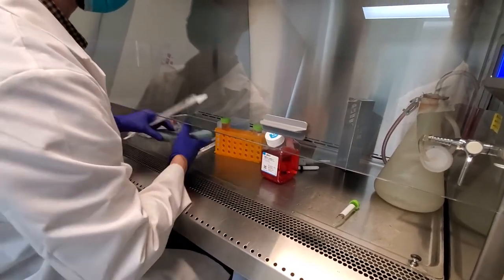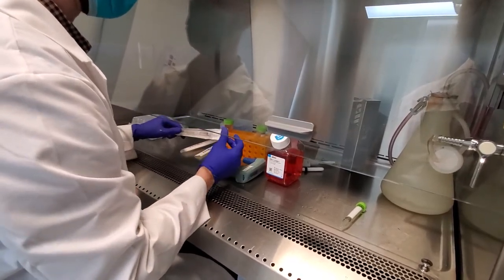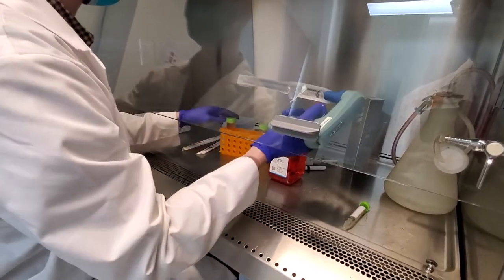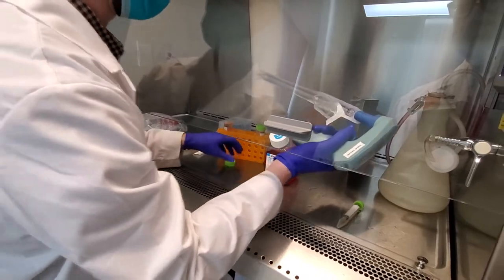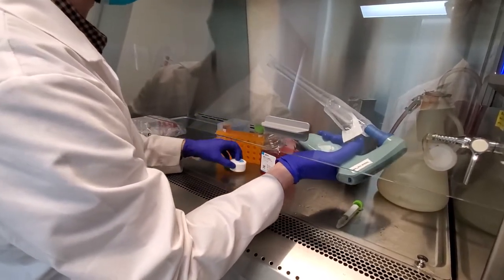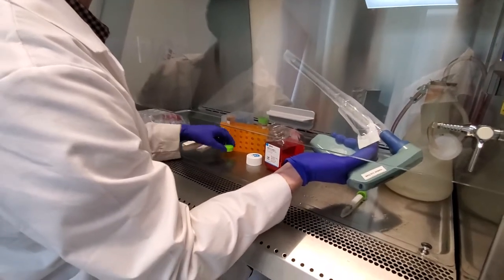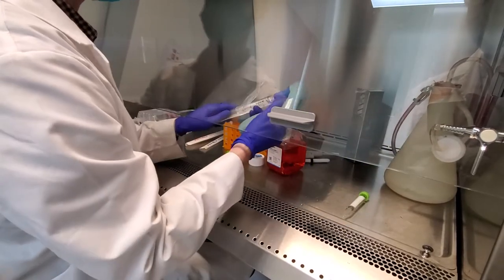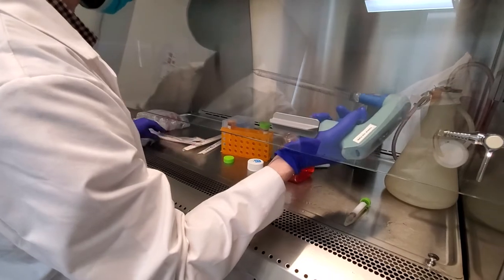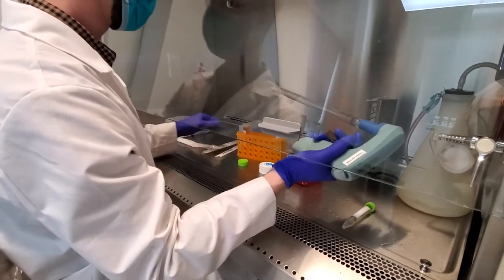I'm going to use good technique: not touching the tip of the pipette, and just opening the top and putting that in. Some people are very particular about how you put the caps down. I like to put them down like this, so nothing drops into the inside of them, and this bottom should be clean. That's my rationale for keeping the caps down. Always keep everything inside the air venting here.